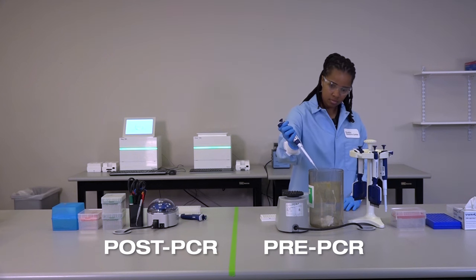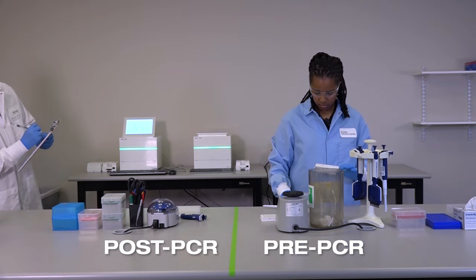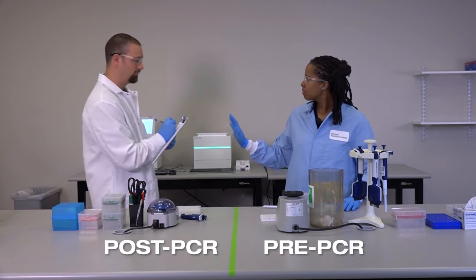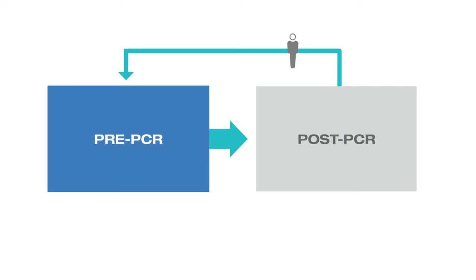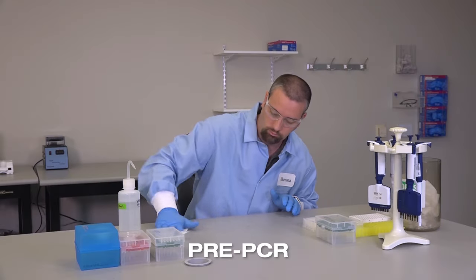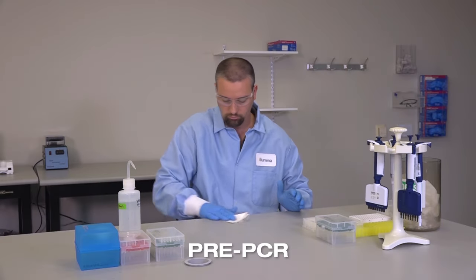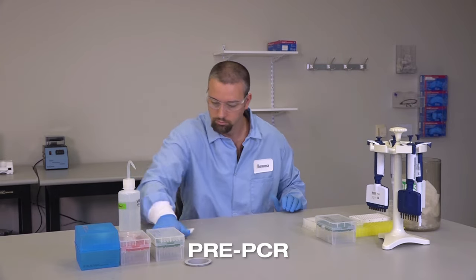Ideally, a lab member who has worked in post-PCR should not return to pre-PCR on the same day. If a lab member must return to pre-PCR after working in post-PCR, carefully put on fresh PPE and thoroughly clean all areas in pre-PCR after you return.